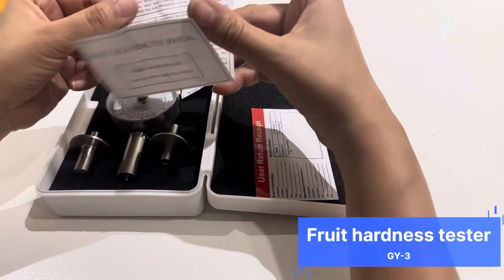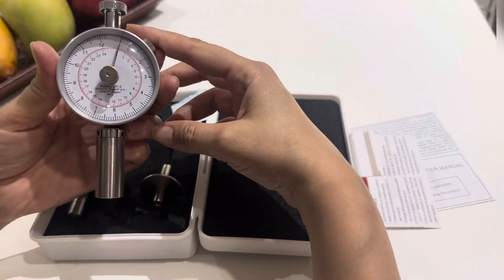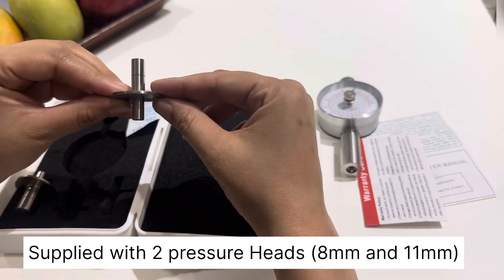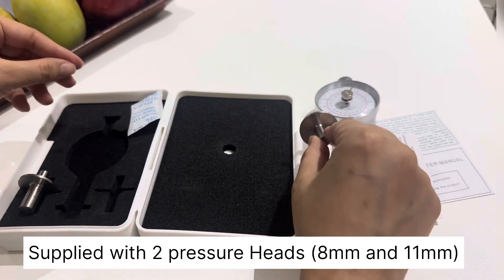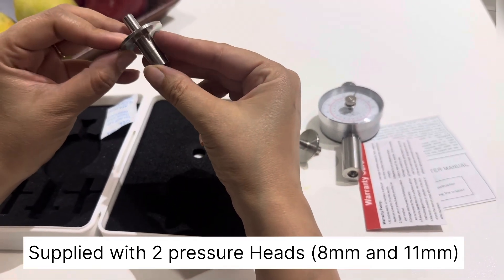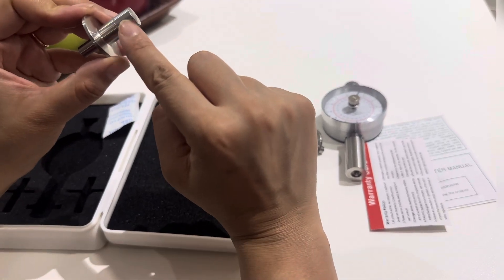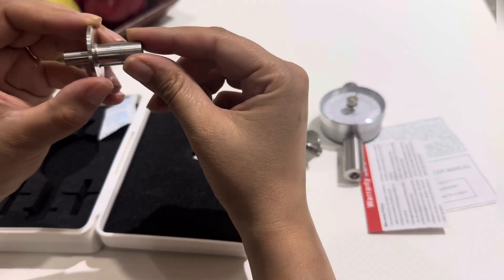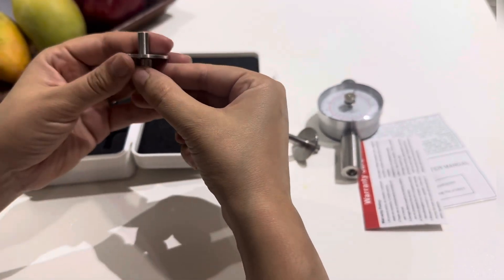The instrument comes with an instruction manual and a warranty card. This is the main unit, the GY3 model. It has two pressure heads — one is 8 mm diameter and the other is 11 mm. There is a marking on the pressure indenter which signifies that while inserting it into the fruit, it should not go below this marking, just to keep a check.